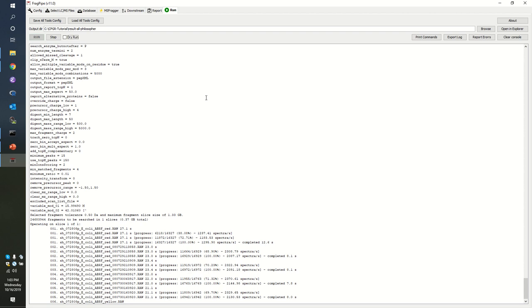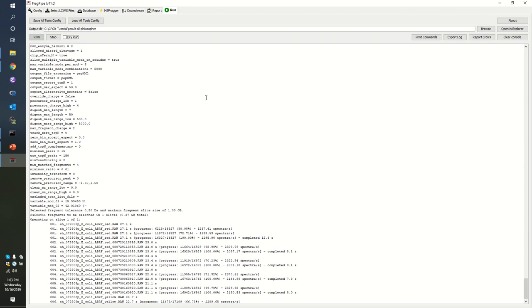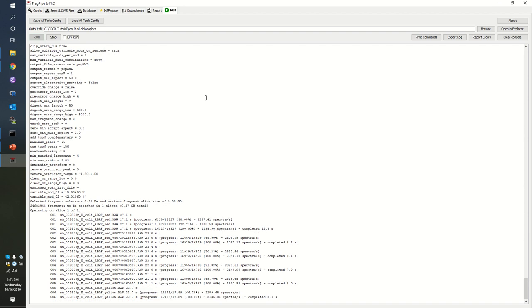You can treat an integration of a peptide as matching a Gaussian to these observed intensities and try to fit one to the other. And say between the middle 90% of this bell curve, you can do something like that.